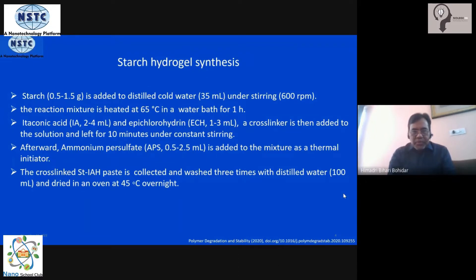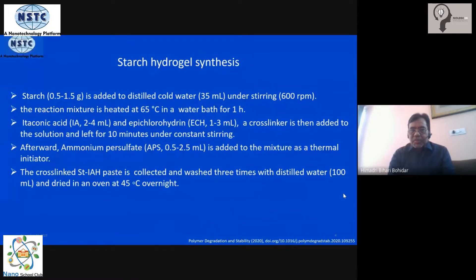Then etaconic acid, 2 to 4 ml, and a crosslinker epichlorohydrin (ECH), about 1 to 3 ml, is added to it. This starts the cross-linking process, and the solution is left for about 10 to 15 minutes under constant stirring.